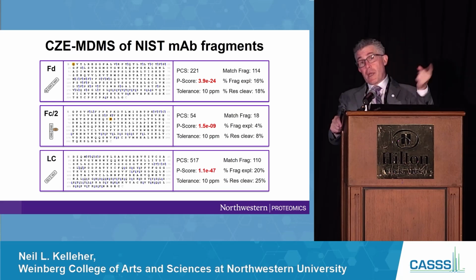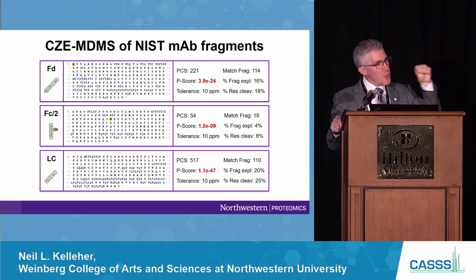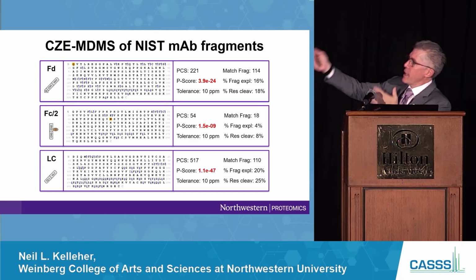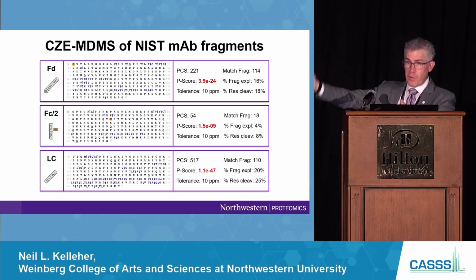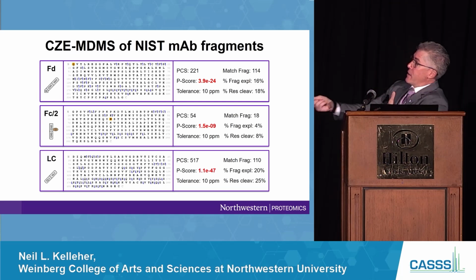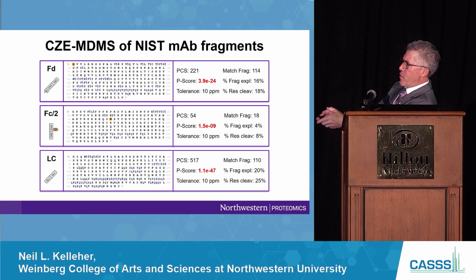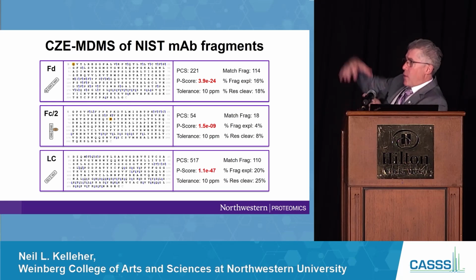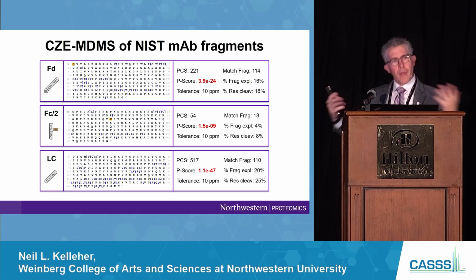And that's true, but now on the tribrids, you have 4 different fragmentation methods to choose from. And if you unleash them on this, you now can get 60, 70, 80% coverage. And there's academic labs like Luca Fornelli at Oklahoma who's showing 90% sequence coverage. And by that, it's meaning to say that these blue flags, that's where you get a fragment ion that mapped to the cleavage of the proteoform at that spot. So now you can imagine getting 70, 80, 90% coverage at this level, and then you've solved that problem.